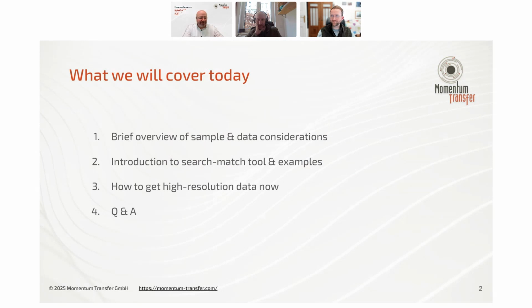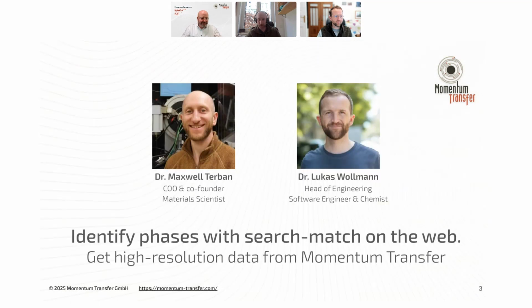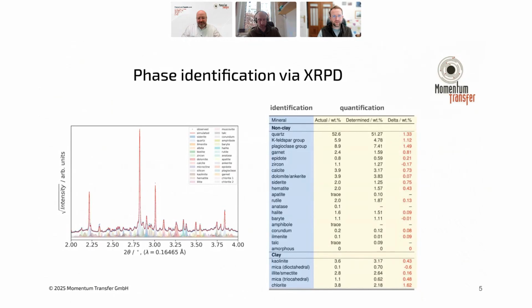You already went into the brief introduction of what we'll do. So I will give an overview of sample and data considerations to make, because I hope we have lots of newcomers to this application and people who maybe want to learn how to do it. And I think it's really important to start with good sample preparation. Then we'll quickly dive right into the actual tool that we created that we hope will be useful for you. So let's get started.